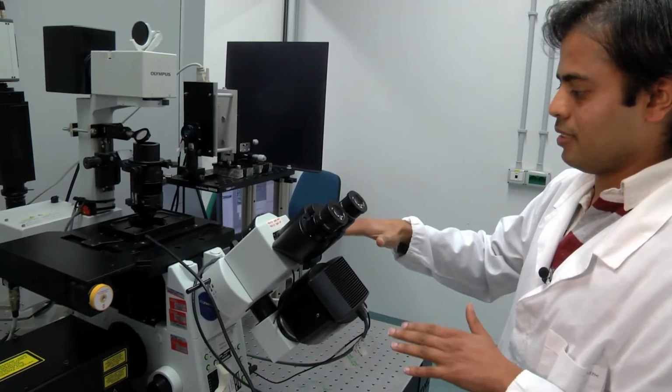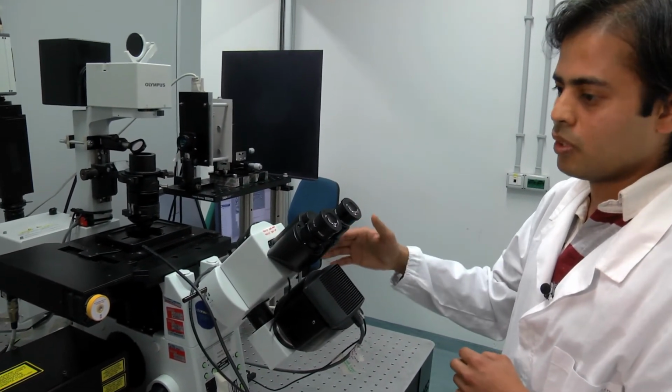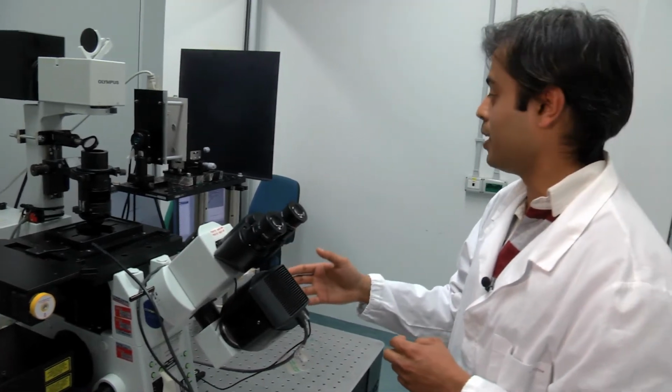I'm a PhD student here. My name is Wasim Sayyed. I came from India. Here, using this optical tweezer as a tool to measure the forces generated by the neurons.